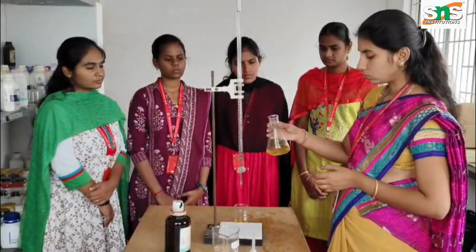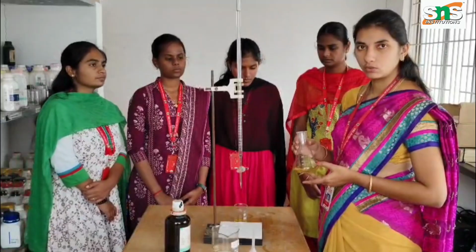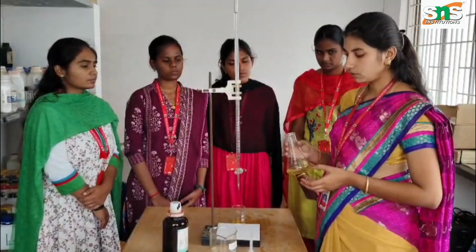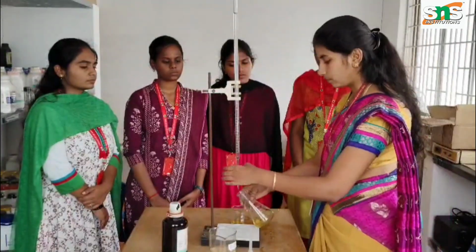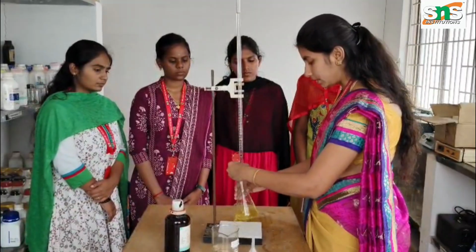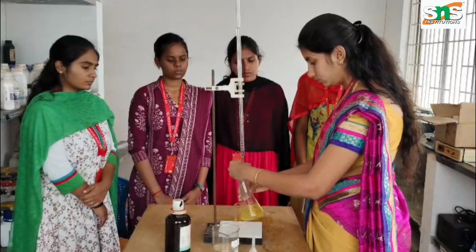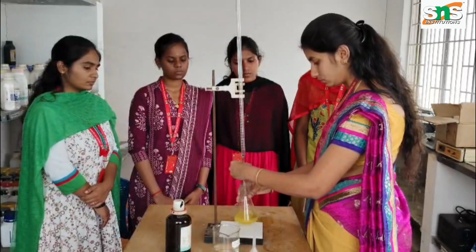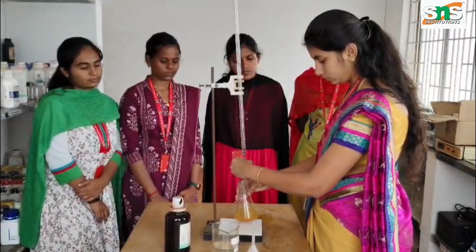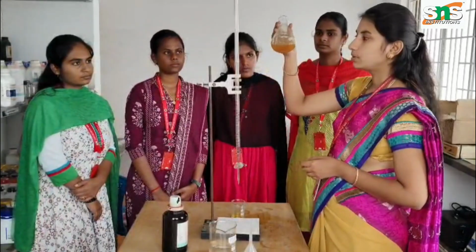With this clear yellow solution, we have to titrate with the burette solution against the pipette solution, and we will get the product as a reddish brown precipitate. So this is our end point. We have to titrate with this titration, and while titrating we have to add the solution drop by drop. While we are titrating, we will get the reddish brown precipitate formation.